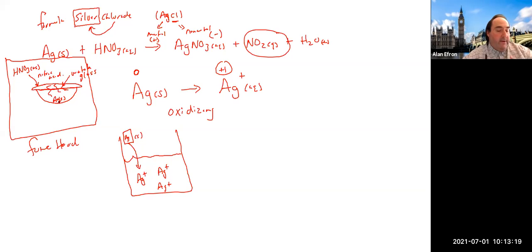You're going to liberate the silver into Ag+, which allows it to be aqueous, part of a water environment, floating around in what is happening in the evaporating dish. So at this point, you let it react until all the silver is dissolved into silver ions.